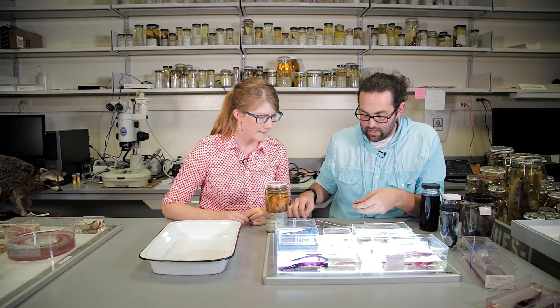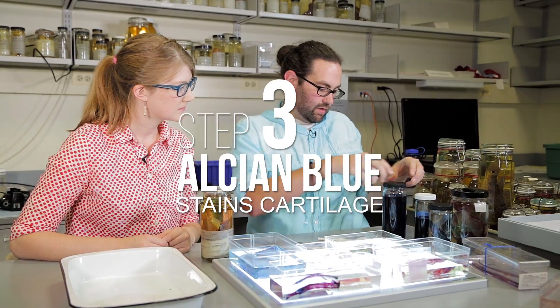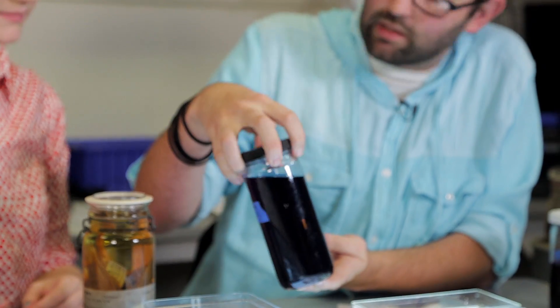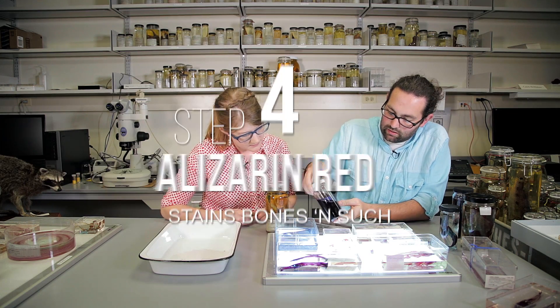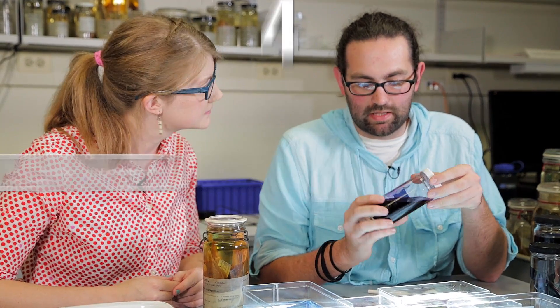In general there are two big phases. First we stain them. We take the fish and use a stain called Alcian Blue, and put the fish in this solution — it's going to stain the cartilage blue. Then we use a red dye called Alizarin Red. Things with calcium phosphate will be stained red by this dye.